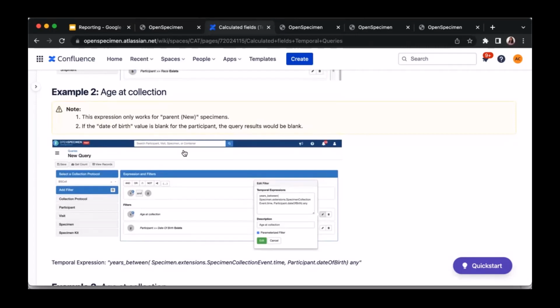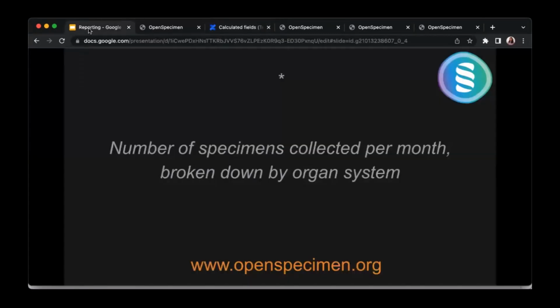And in your particular example, we use a temporal expression because the collection date has the day, like 20th March 1991, and the time. But what you wanted is just the month and year part from that whole date. Since we had to do the processing, that's the reason the temporal expression is used.